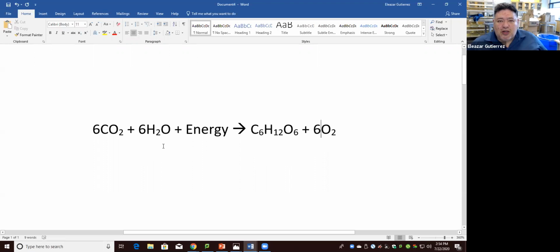This is why it's important that when we put the discs in the syringes, that we degas them. In other words, we're taking all the gas from the atmosphere that's inside the discs, and we know that there's no more gas in the discs because they stop floating. Does that make sense? They come down to the bottom of the syringe. And then when we put light there, the discs are going to harvest that energy.